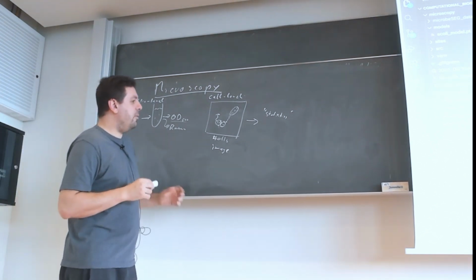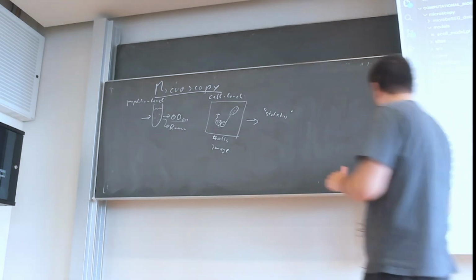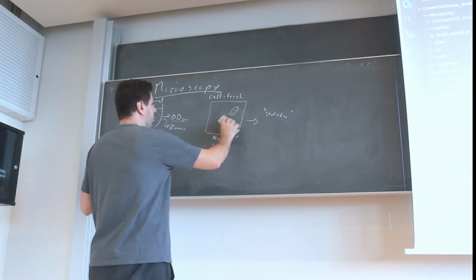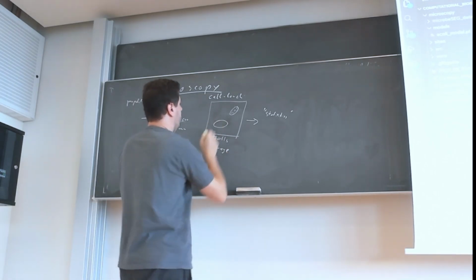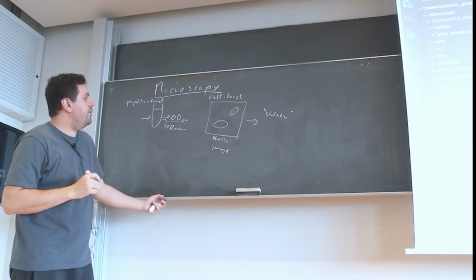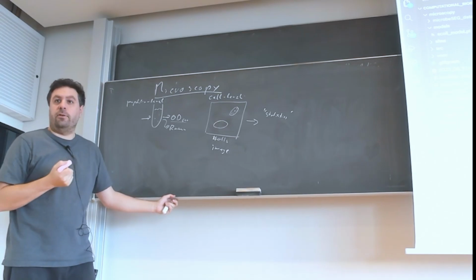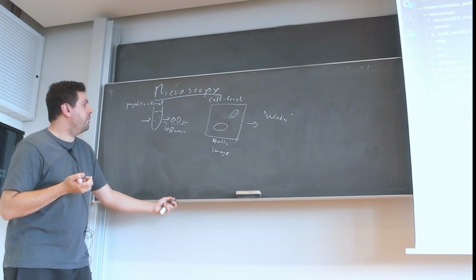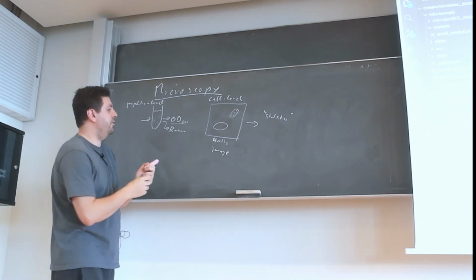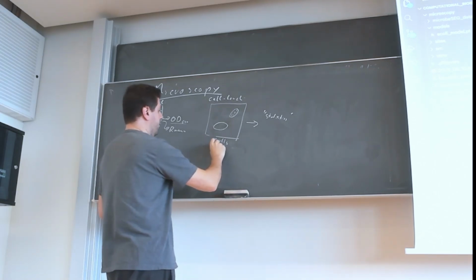And a very common question is, let's say you have here your image, and let's look for the moment at a single image. You might be interested in a problem that is called segmentation of this image. Perhaps the even more abstract problem would be labeling this image. For example, you could label this image with there are cells on it, or there are E. coli on it.